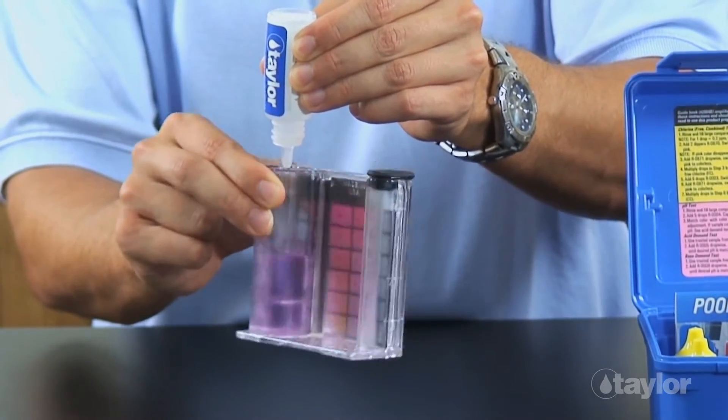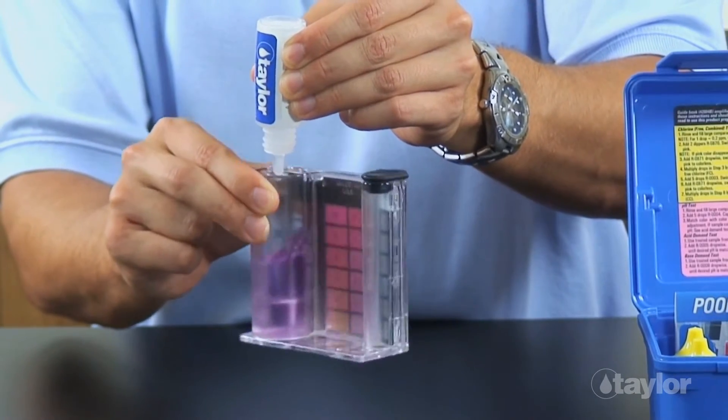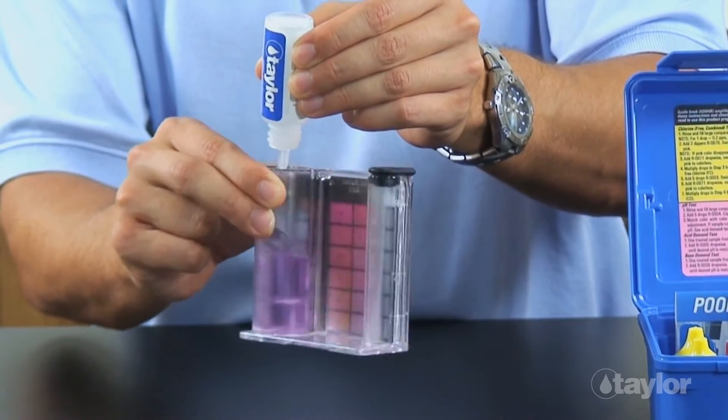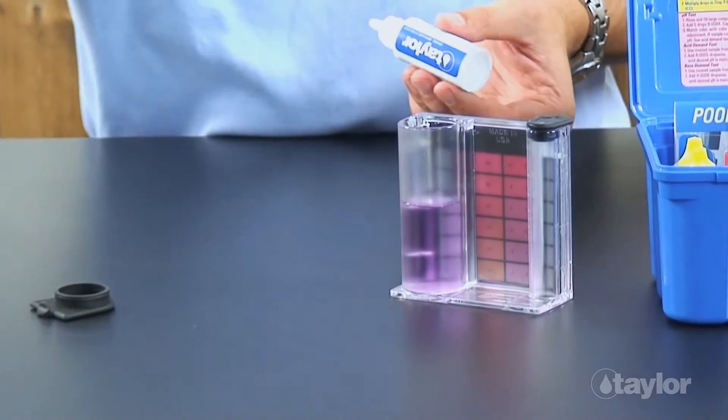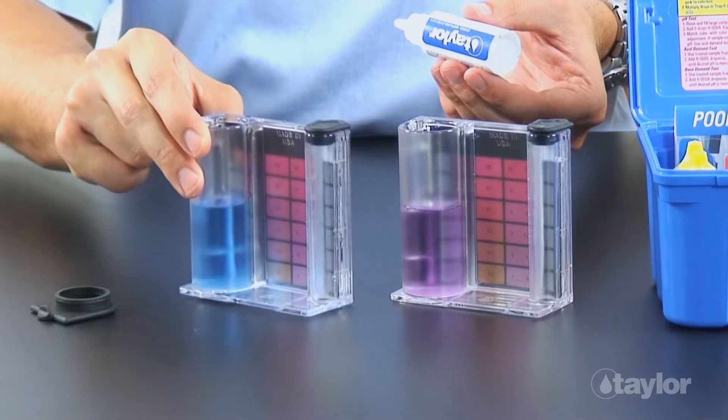This fading endpoint is due to interferences from metal ions, most likely copper or iron. Copper can enter the water from pipes, source water, or overuse of copper-based algaecides. Iron can be present in source water.